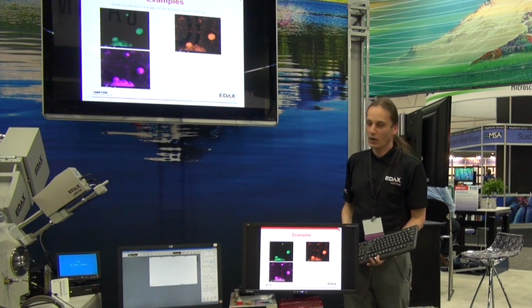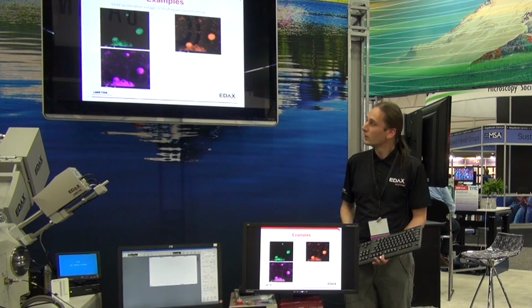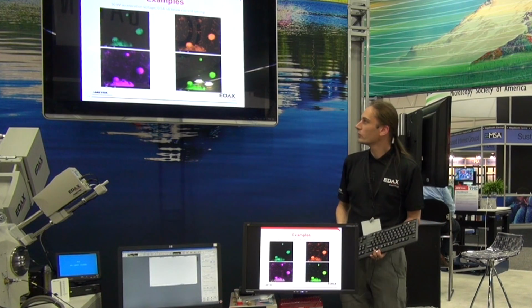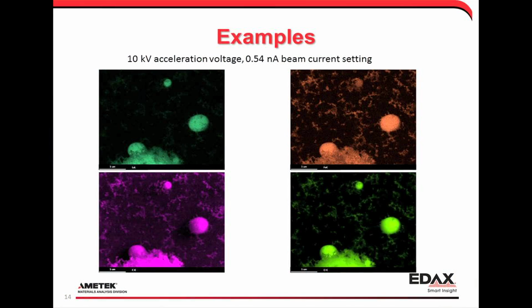We have carbon all over the place, confined on the particles primarily. And the particles, all of them are oxidized, as I would expect, because of the high temperature and they've been flying out in atmospheric air. So everything is oxidized except the substrate, which is pure silicon.